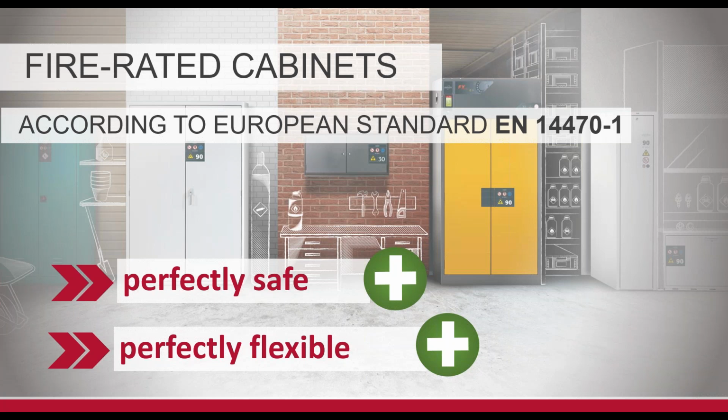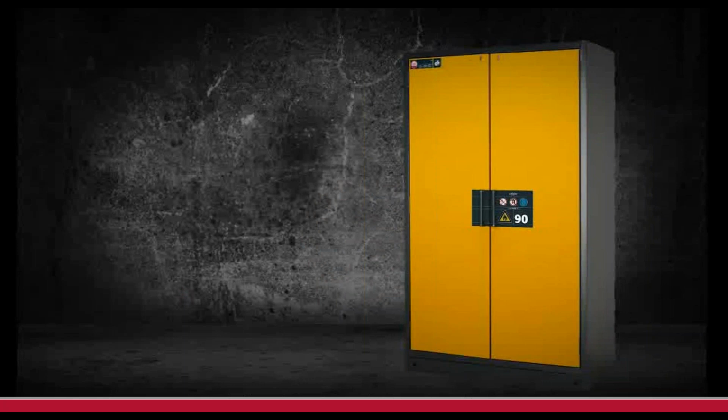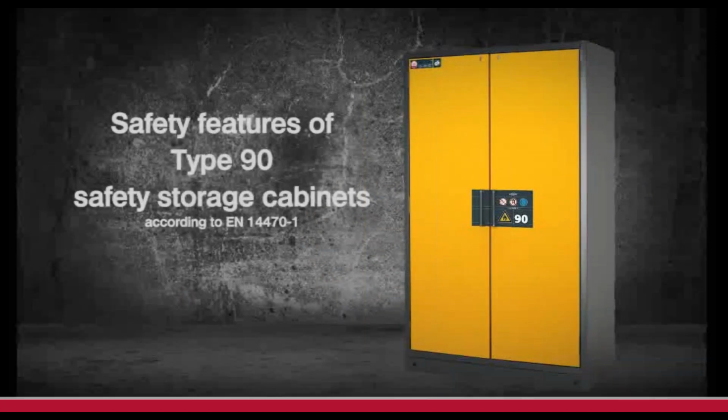The way you can achieve 90 minutes, in the cabinets that are tested to the EN standard, is that things start happening on the inside of this. This gives you a good example of what I'm talking about, and it's pretty typical amongst the 90-minute cabinets. They all actively fight the fire. I'm sorry, not fight the fire, but resist the fire.